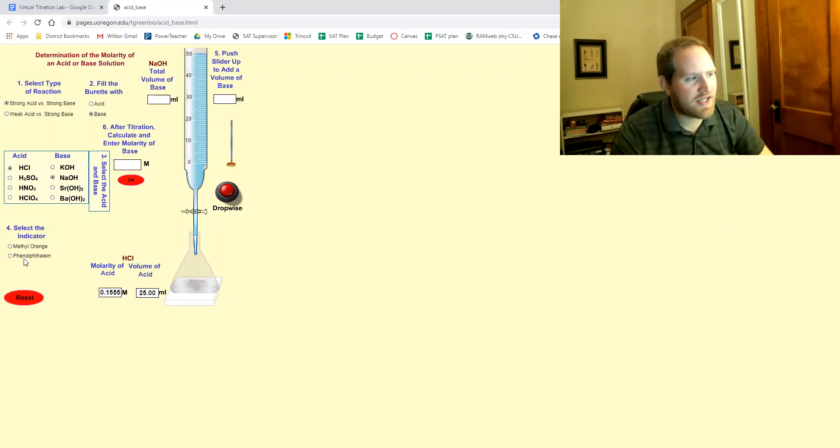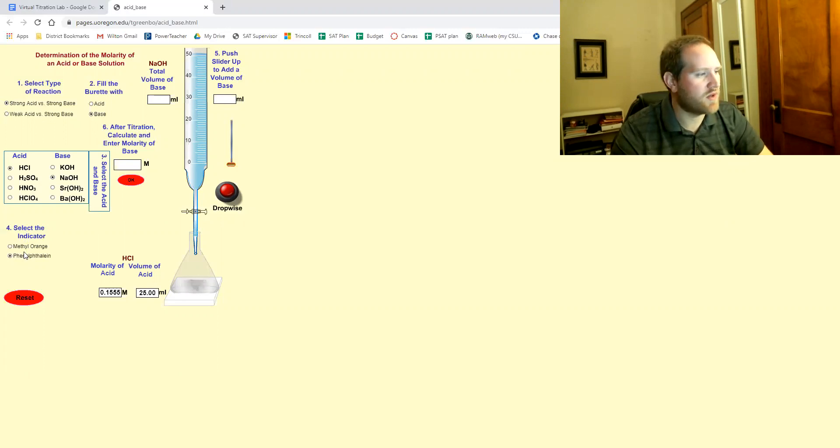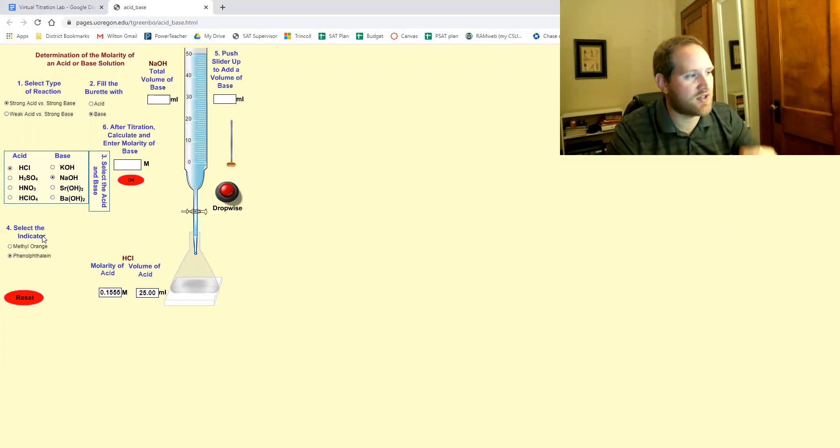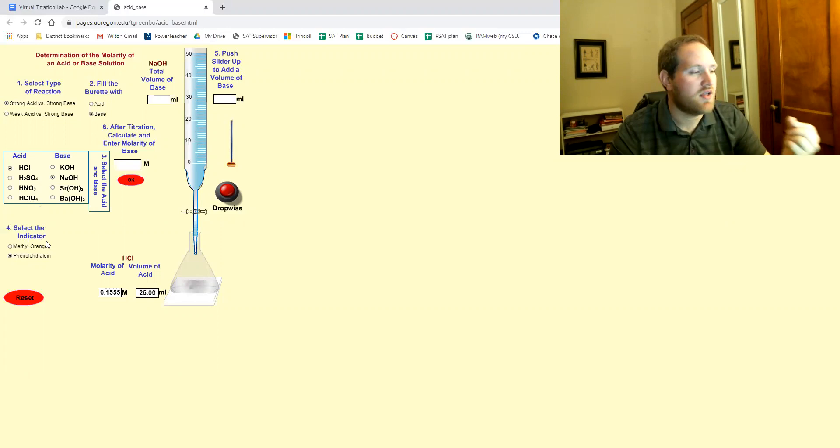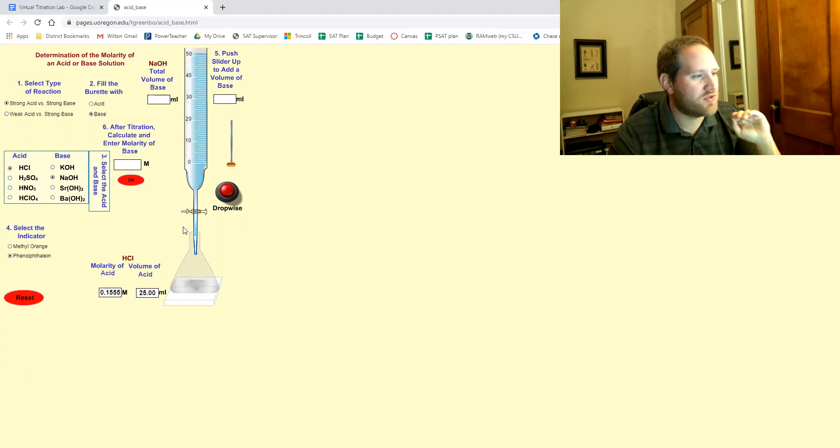For an indicator we're gonna use phenolphthalein. This is the one that's clear in acid and it's that hot pink color in base. So with those four settings we're ready to go.